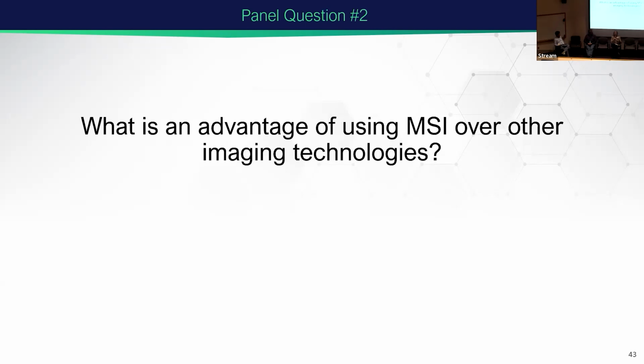We might not get that same depth of coverage as we do if we just homogenize everything, huge bulk samples, do all the identifications. But you get that really nice spatially resolved pattern, which you're not going to get with other methods. So we're overcoming the limitations slowly together. That's actually a good point too.